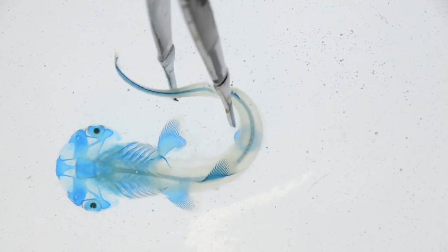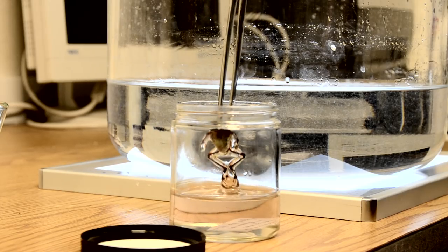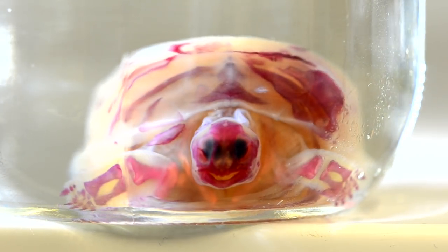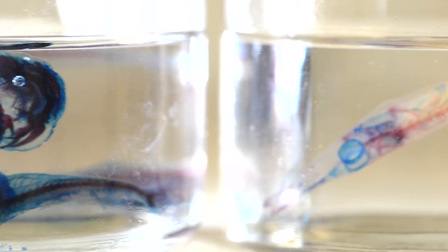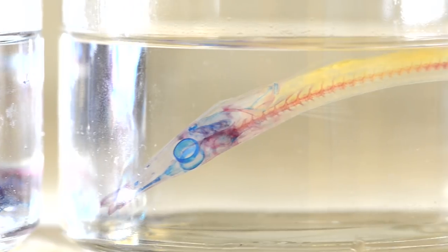For 18 years I've been clearing and staining fishes and amphibians and reptiles. There are 25,000 species of fish. I'm willing to say that I want one of every one of them. Picking and choosing amongst the very most interesting ones is part of the fun.